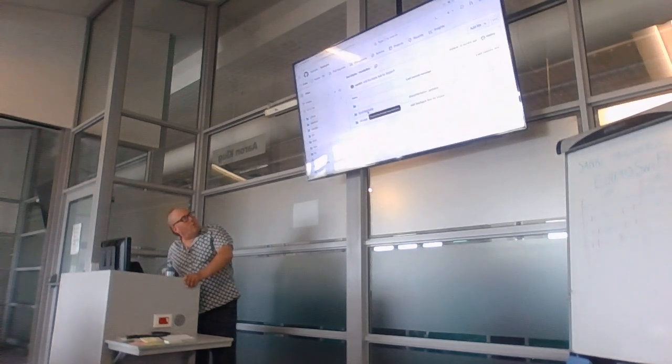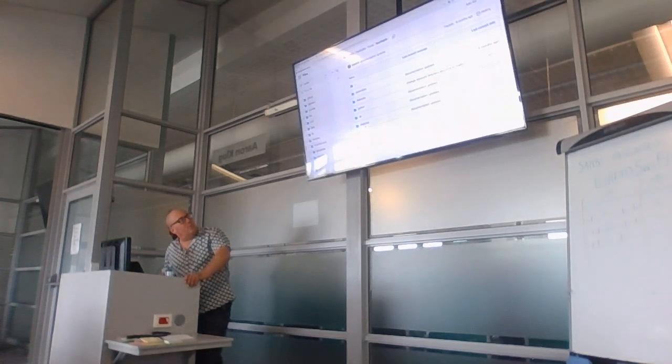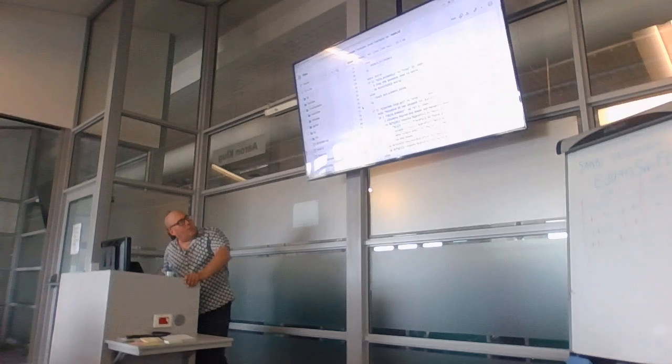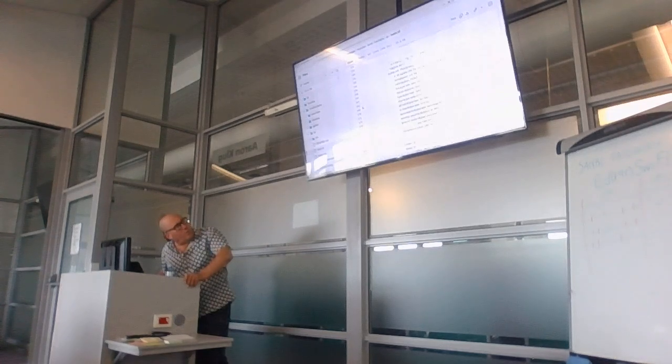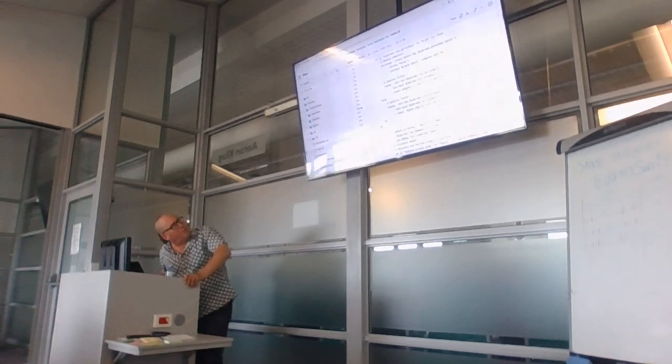And then local. So the NF core modules are the ones imported from the NF core project, okay? But local are ones that Robert wrote himself. Oh, there's QC. And there's main. Okay? And there's process QC. If we look at the bottom, there should be a workflow. Is there a workflow? There's a lot going on here. Yeah, so it's just got a process, which is the process in Nextflow. Remember, the thing that does the actual work. Okay?